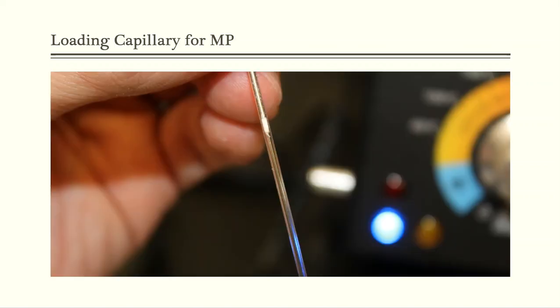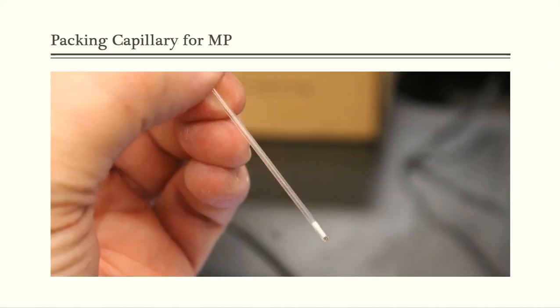Here in the next part of the lab, what we had to do was confirm that we had benzoic acid, and this required another melting point. So what you're seeing here is a capillary tube, of course. There's a small plug of sample in that capillary tube, and right now I'm putting the tamping device in through the top of the capillary and pushing it down into the bottom of the tube.